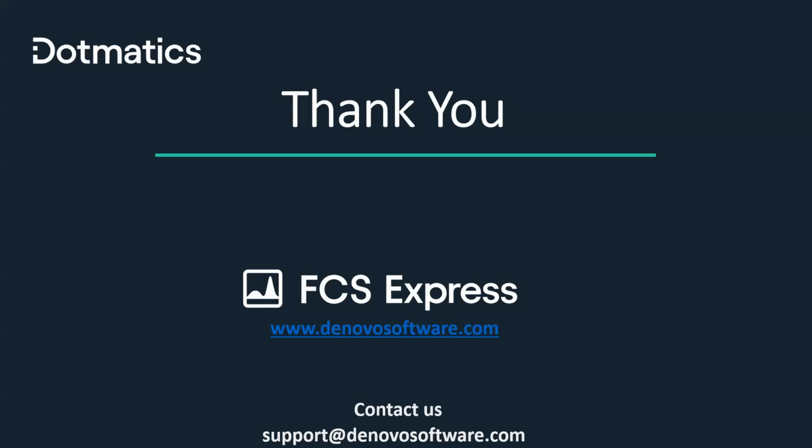Great, and I see there's another question asking how FCS Express dovetails with tools like OMIQ. I think that applies more generally to the tools at Dotmatics, because we have a lot of great software offerings in the flow cytometry world. Dotmatics is the parent company of OMIQ. It's the parent company of EasyPanel, right?